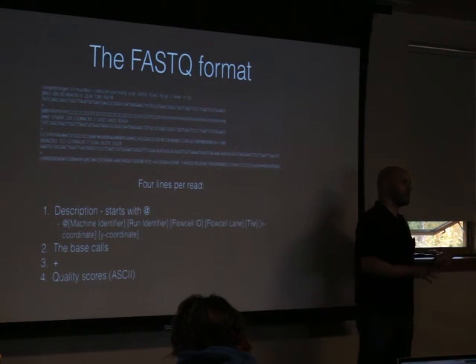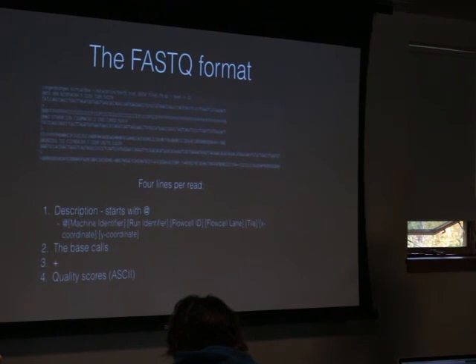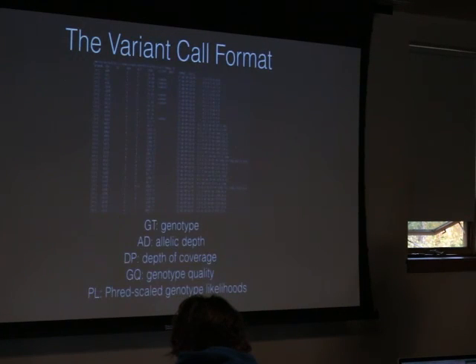I'm going to walk around and see if you have any questions or any concerns. Let me know if one of the commands doesn't work. It might be the case that something has changed in the interim, and I'm more than happy to figure that out. And then I'll stop every now and then. I'm going to go over the SAM format and the variant call format.